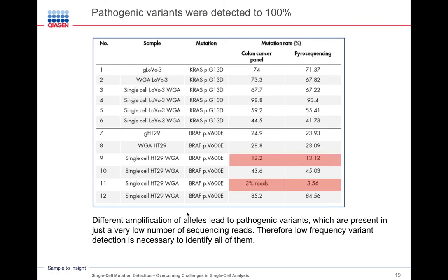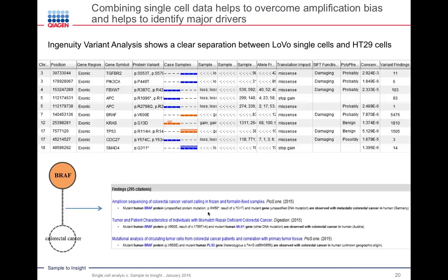single cells are. And you can imagine that would be particularly useful when one has data coming from different tissue, primary tissue versus metastatic sample. And once you have identified your cluster of variants, the next thing you would want to do is upload all of the variants from each of the experiments and see how those are identified within variant analysis.